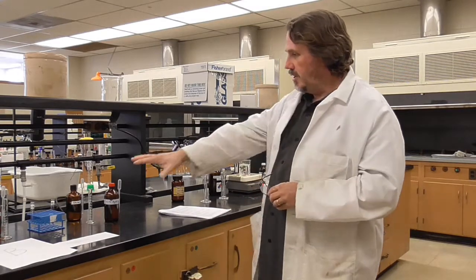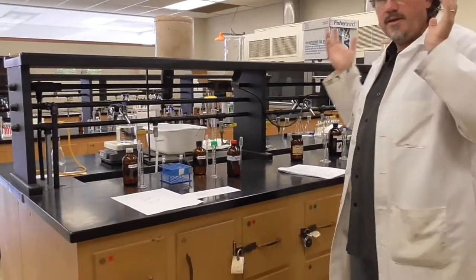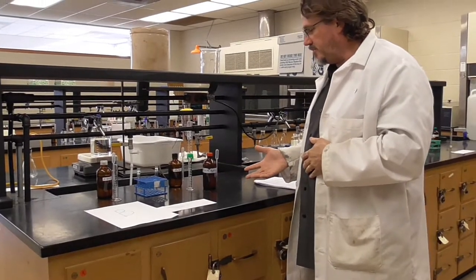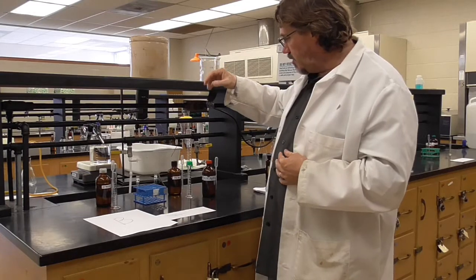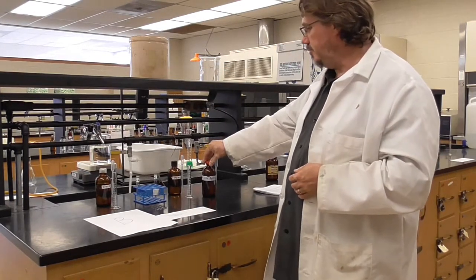So here's the first station in part B, the chloride test. Chloride is one of the ions that are found in living cells, and that's why we're going to be testing for it here. We can use what's called the silver nitrate test to detect chlorides in solution.